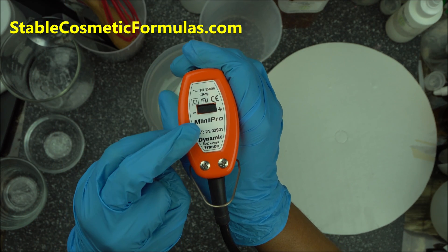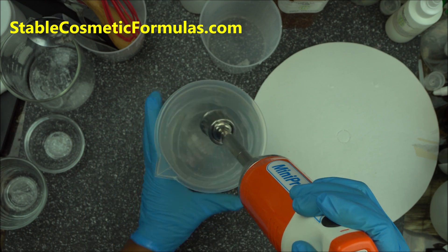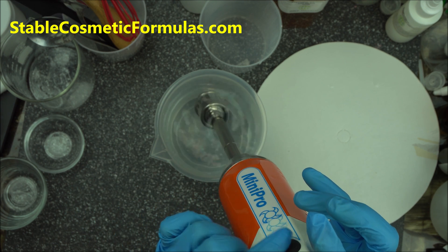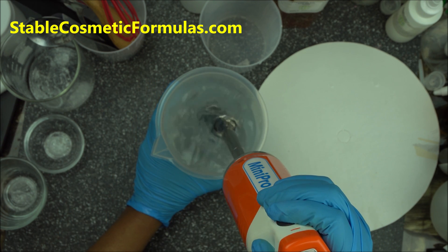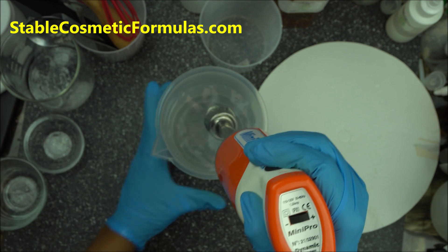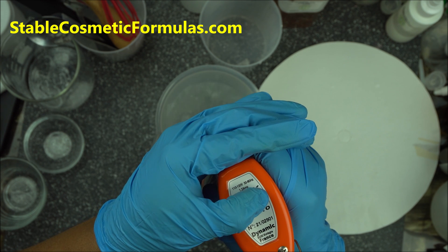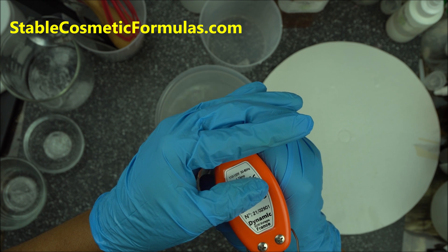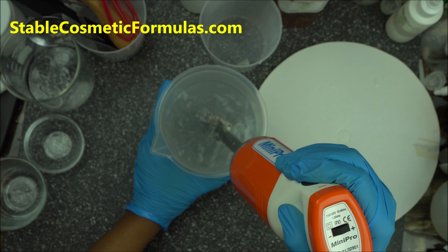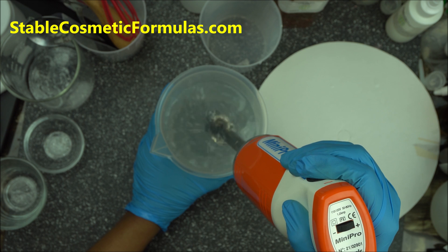It's excellent — you will love it. All you have to do is make sure it's dipped into whatever you want to process and just press the button here. You can control the speed from here — lower it or increase it. As you can see, this is a homogenizer, a very very useful tool for cosmetic formulators.